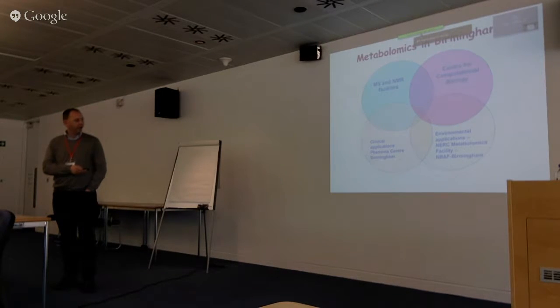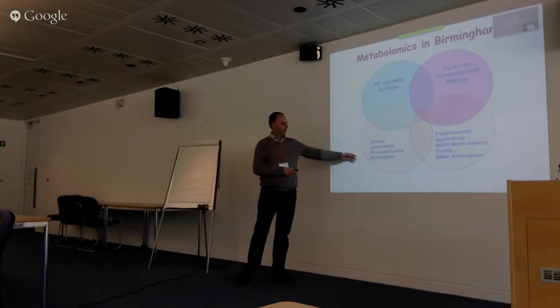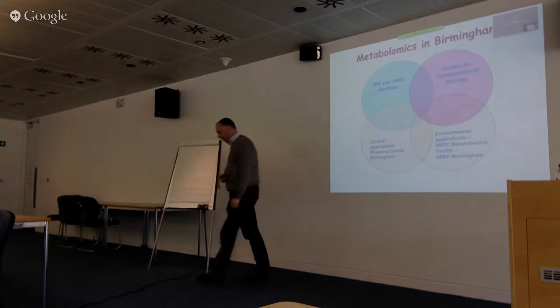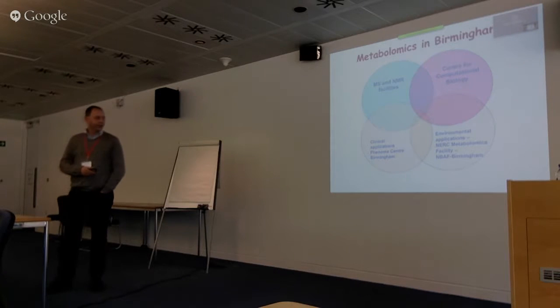And then we have two large facilities, the Phenome Centre Birmingham, which will be up and running by the end of the year. We have a lab now, as of this week. And then there's the older metabolomics facility, the Birmingham facility, which is NERC funded, which Mark directs. So we've got different aspects, both mass spec and NMR data going into different applications as well.